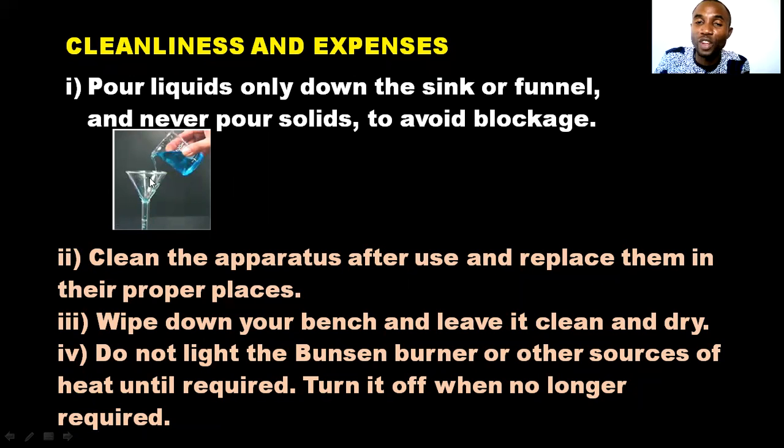We are talking generally about precautions, about the dangers that are in the lab. Now, the cleanness aspect: pour liquid only in this funnel. Next, clean the apparatus after use and replace them in their proper places. At the end of your practicals, wash them and keep them back. Wipe down your bench and leave it clean and dry.